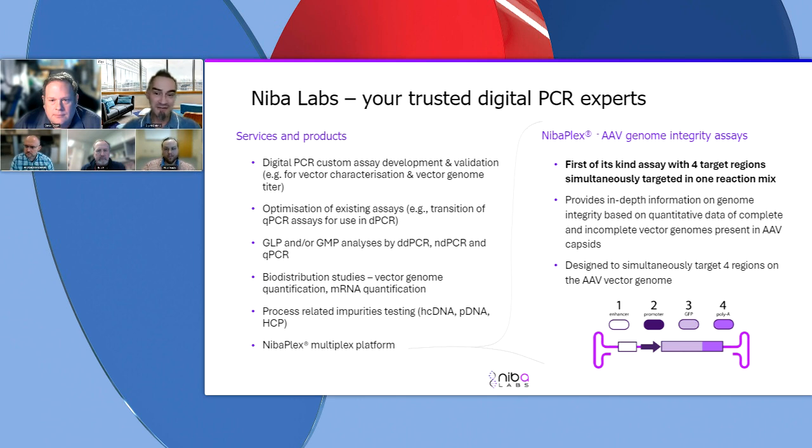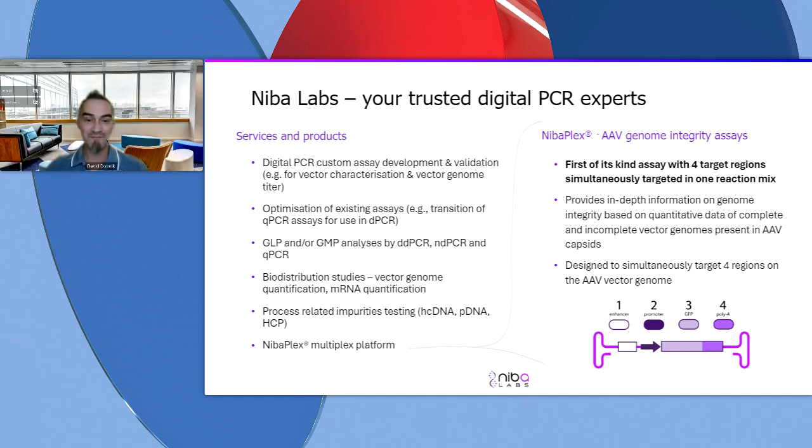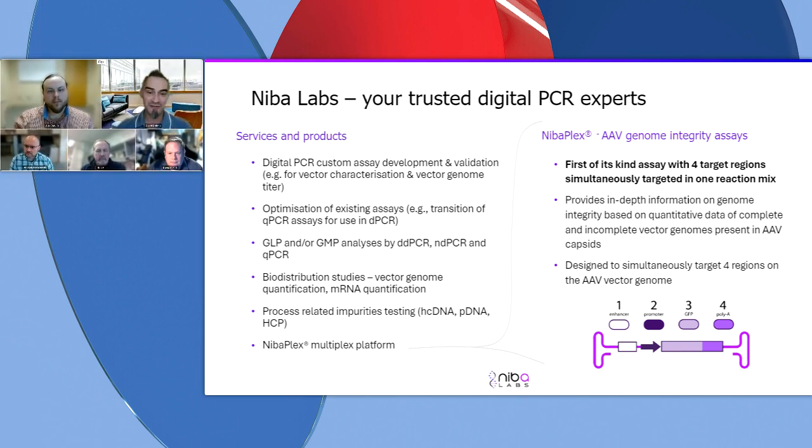Since we've been doing that now for 3 years already, at that time, this kind of integrity application was not even intended with the software of the producers of digital PCR platforms. And we just had to come up with some ideas of how to analyze this kind of data that we get. And at least QIAGEN was at that time definitely leading, at least with the multiple occupancy readout that the software provided.